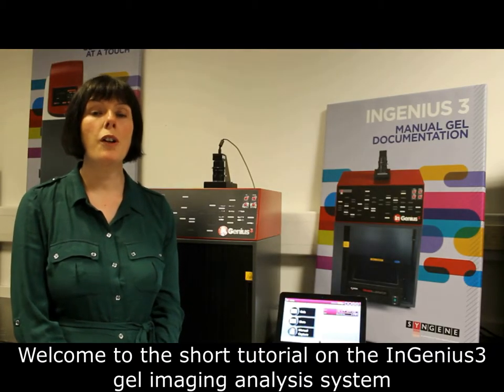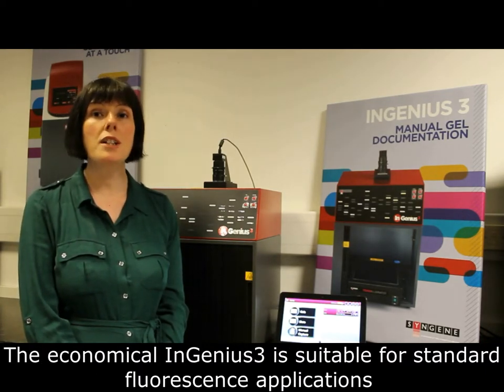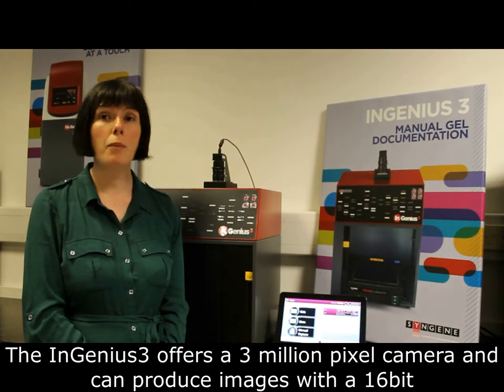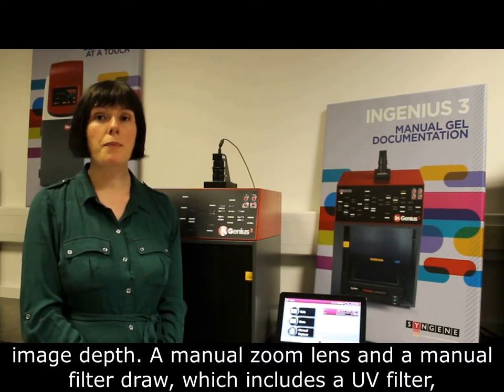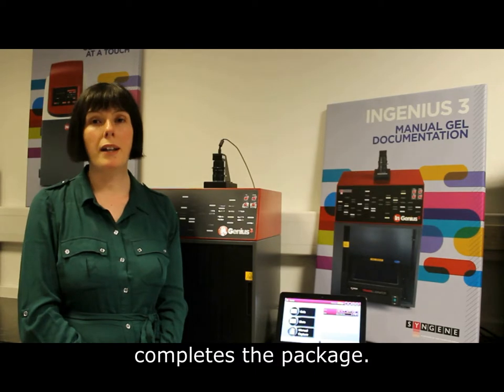Welcome to the short tutorial on the InGenius 3 gel imaging analysis system. The economical InGenius 3 is suitable for standard fluorescence applications. It offers a 3 million pixel camera and can produce images with a 16-bit image depth. A manual zoom lens and a manual filter draw, which includes a UV filter, completes the package.